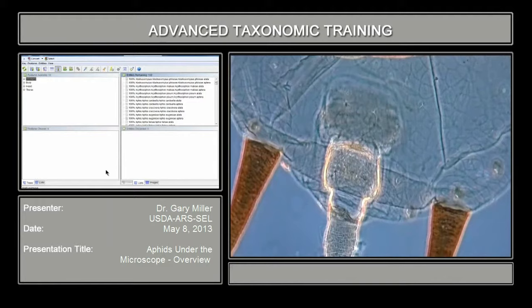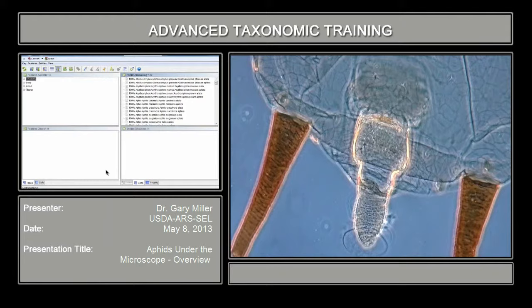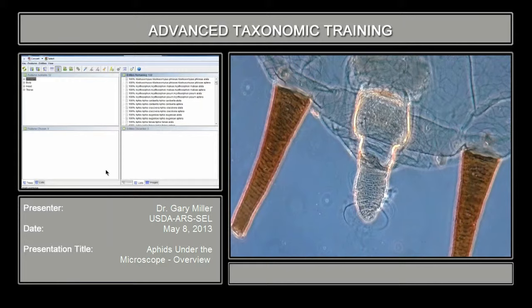One thing that is very important when identifying aphids is that immatures often resemble the adults, so it's sometimes hard to tell what is an adult and what is an immature. Most keys — nearly all keys — are based on adults. One telltale way to identify an adult is the genital plate: there's a large structure called the genital plate, and if that is present, you have an adult. The structure below that is called the anal plate, which is sometimes confused in an immature, but you're specifically looking for that genital plate.